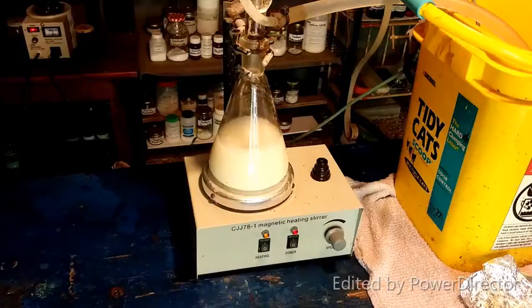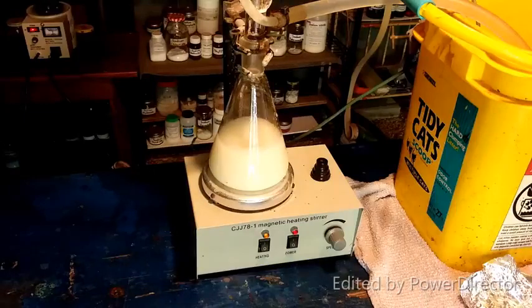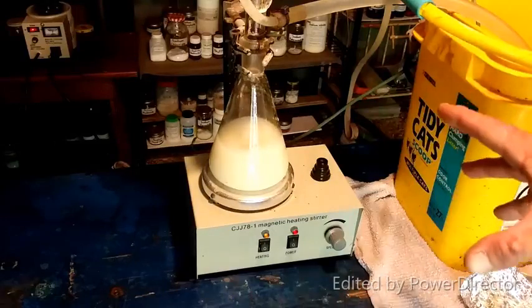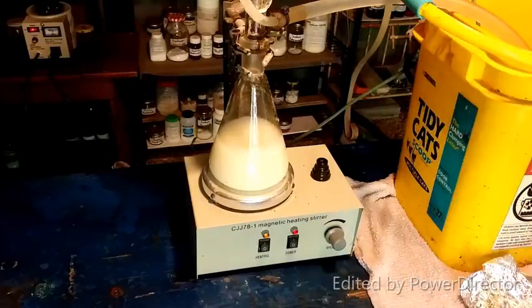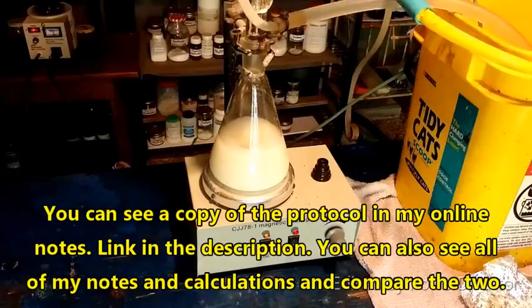done or not. But thanks to somebody on Discord, and I'm probably going to mispronounce his username there, but Naragen? I don't know, dude, correct me in the comments. But anyway, he managed to find an actual synthesis protocol to make this very product the way that we're doing it. I was very encouraged to see that my prep method was not terribly far off. So anyway, in that method, it went for about 20 hours before they stopped the reflux. So that's what I'm going to do.